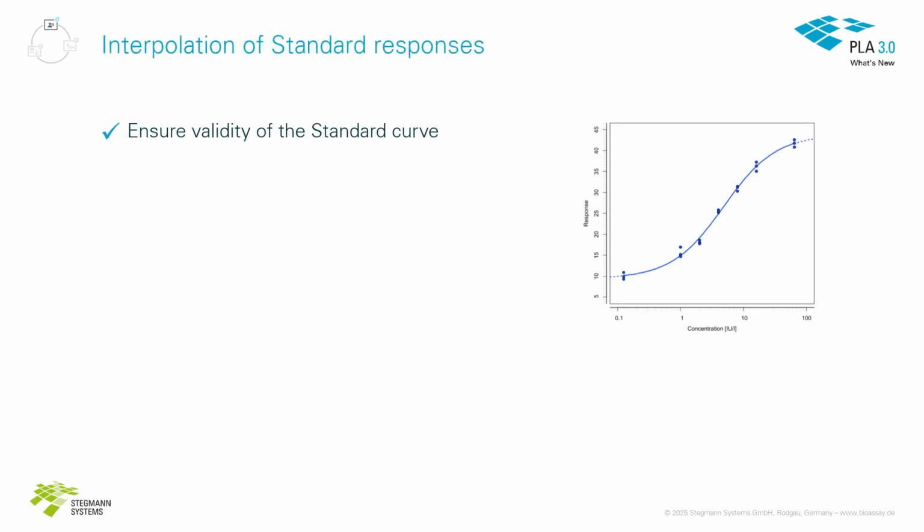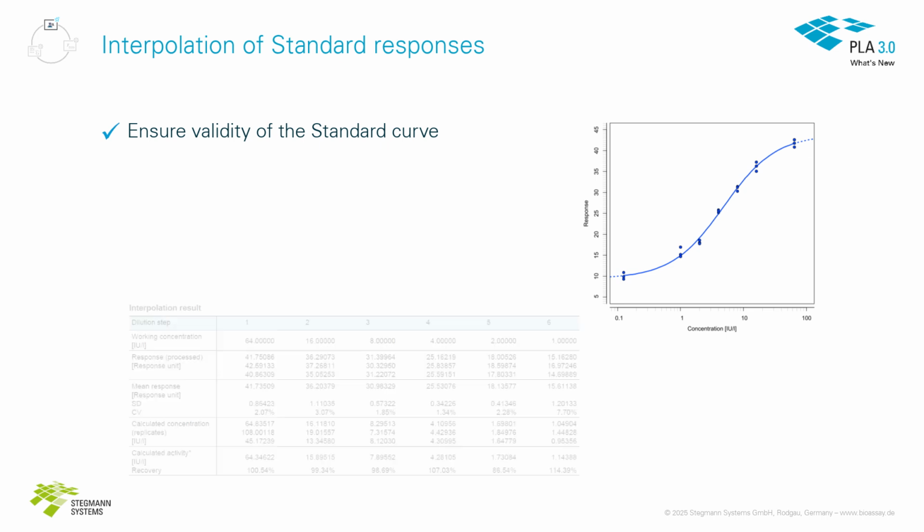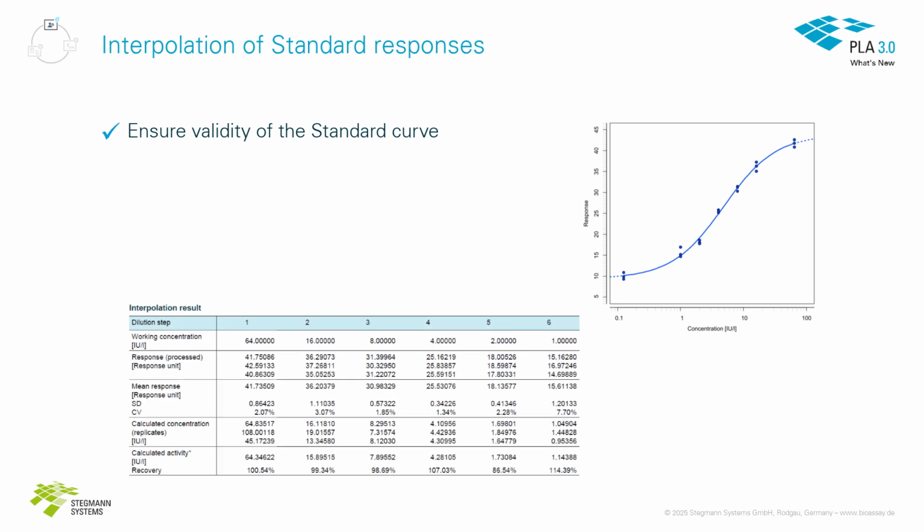Furthermore, you can ensure validity of the standard curve by checking interpolated standard responses. The detailed report now shows the calculated substance activity and its recovery based on the assigned concentration per step.